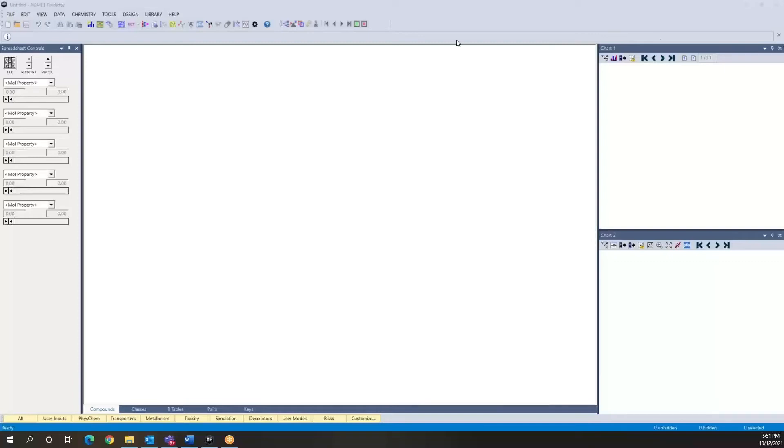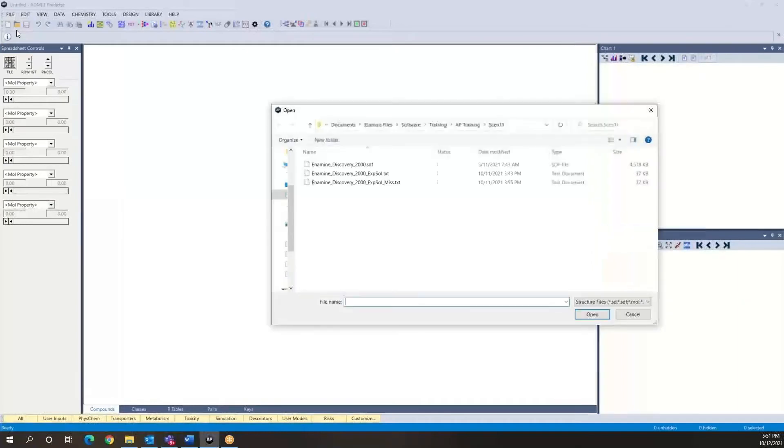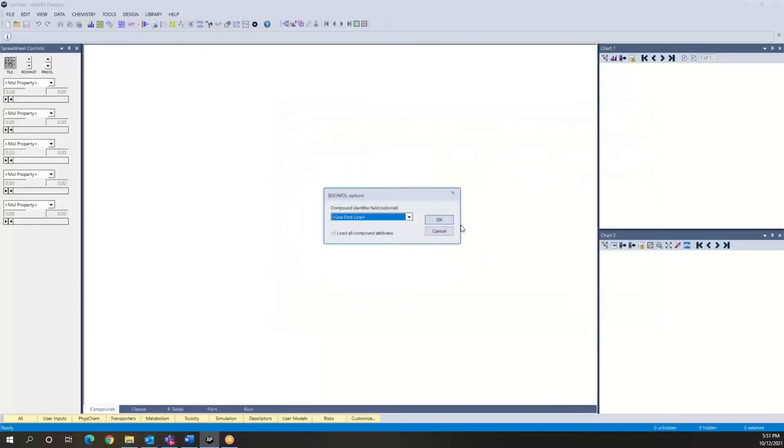So let's go back to this data set that we used previously, which is this subset of the Enamine diversity set. We're going to load these 2000 compounds as we've done before.